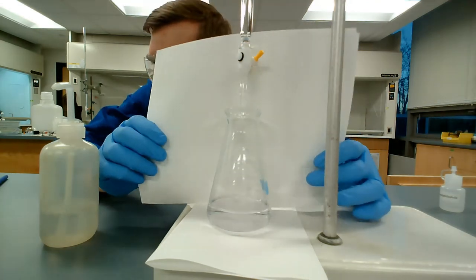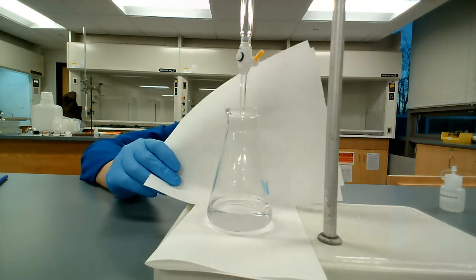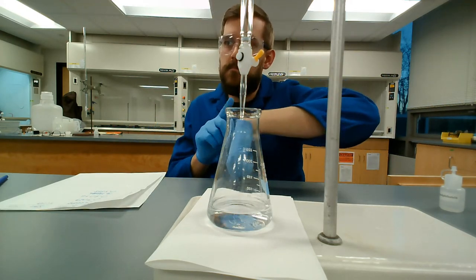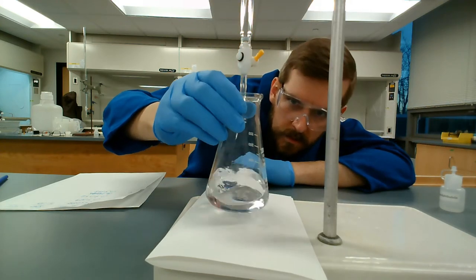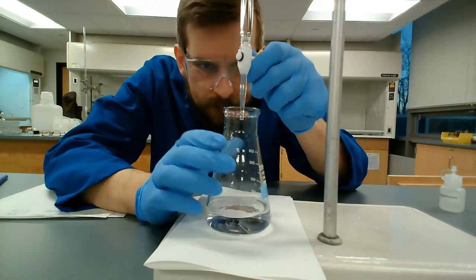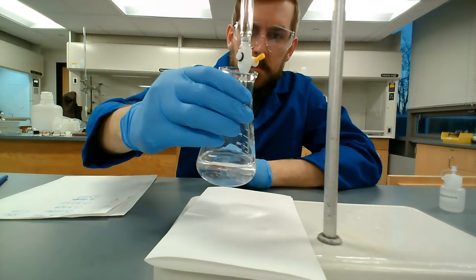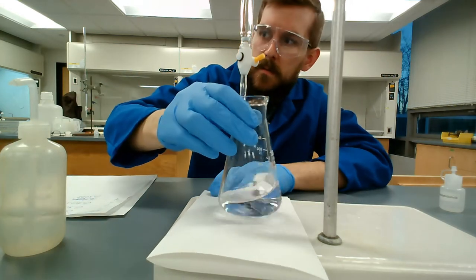I'm trying to put the piece of paper here behind just to show you guys. But as I'm doing this, the pink color, I think, starts to fade a little bit. So when you think you're really close to the end of a titration, you should give it 20, 30 seconds to make sure that color persists for a little while first. It's not. So I think I'm really close. I'm going to let out a tiny bit of a drop here. I accidentally let out a full drop. I meant to do a partial drop, but that's okay. It's our first titration.